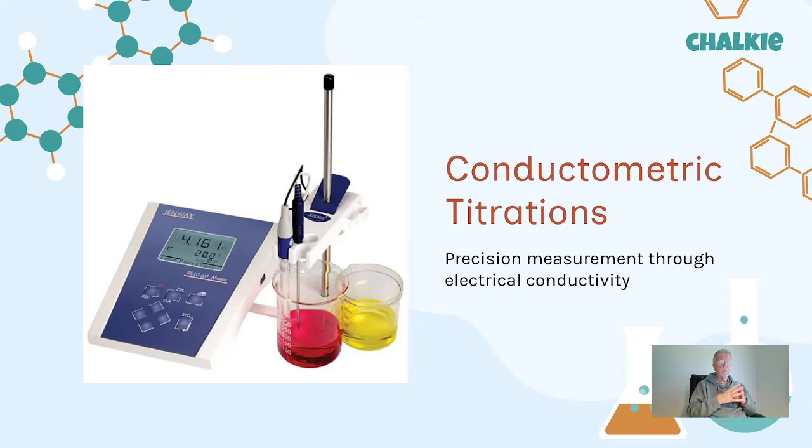Now, in a normal acid-base titration, one of the solutions goes into the conical flask, measured accurately with a pipette. You then add an indicator, so you will see a color change, and then you add the other solution from the burette until the indicator changes color, telling you have reached the end point and equivalence point. Those are different things. They will not be involved in this particular topic because it's purely for normal titrations.